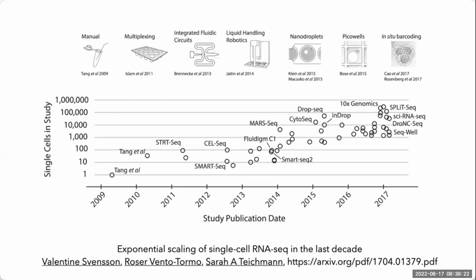So, for example, this is an excellent review published around 2017, and it contains relevant publications and compiles an interesting list of protocols that can be automated or employed to perform single cell RNA-Seq analysis or single cell RNA-Seq data collection in general.